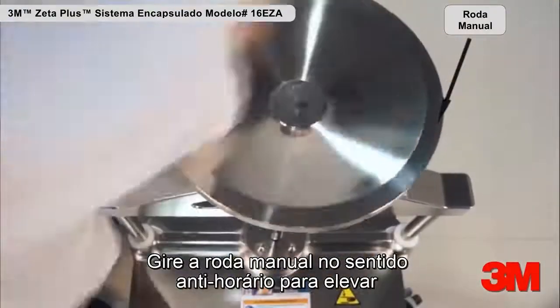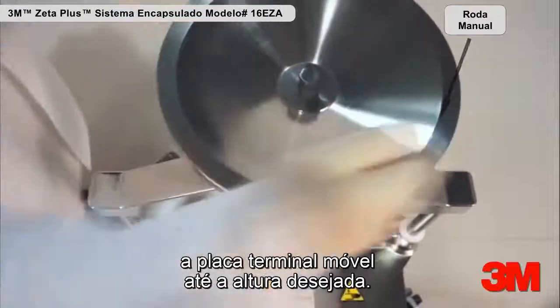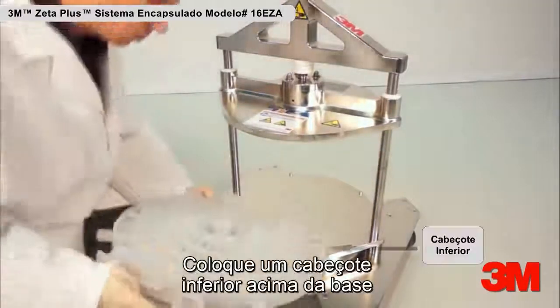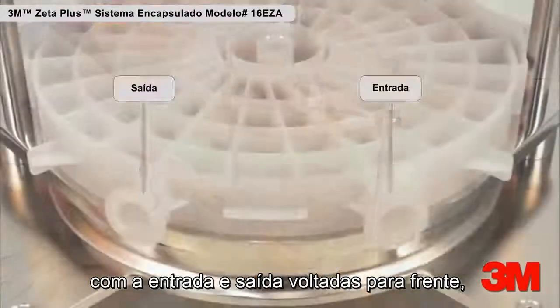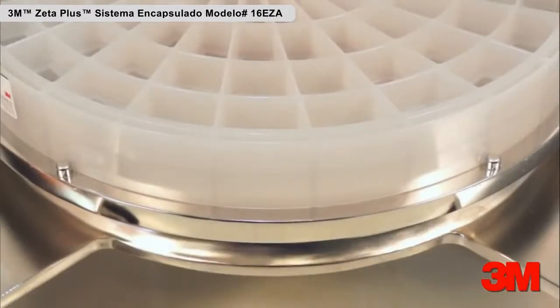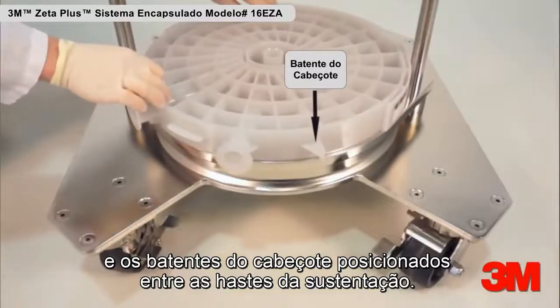Turn the hand wheel counterclockwise to move the movable end plate upward to the desired height. Place a bottom manifold onto the base with the inlet and outlet facing forward, the back side touching the two stop pins, and the manifold stops positioned between the support rods.